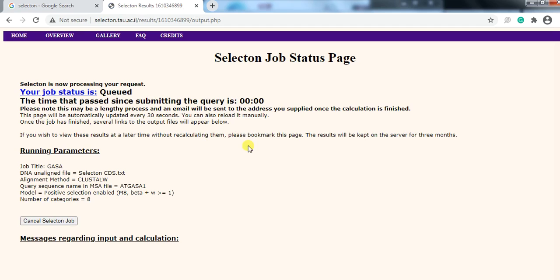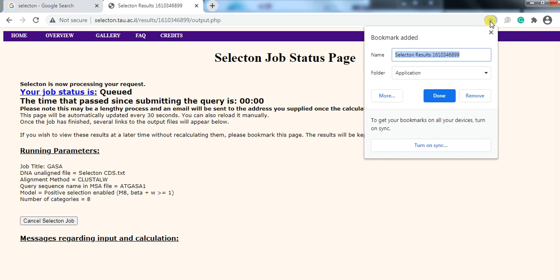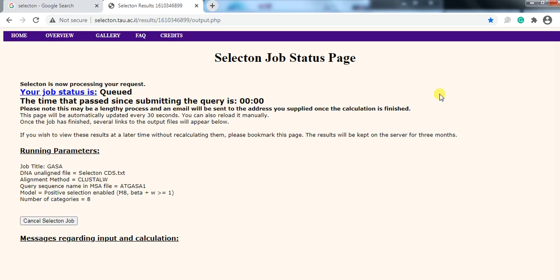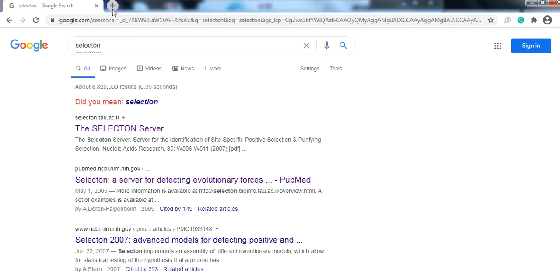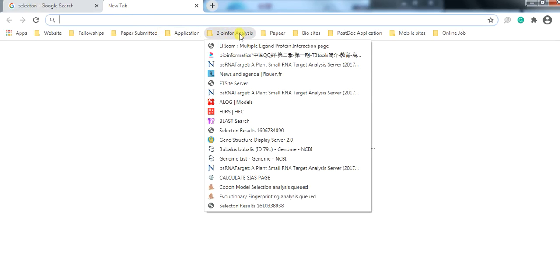When you click on submit, it will give you a job title and here is the selection job status page. The status is shown at this point and the analysis is running. You need to bookmark this job because it takes a little bit of time. After some time, we will come back and open it to check whether our analysis has finished or not.